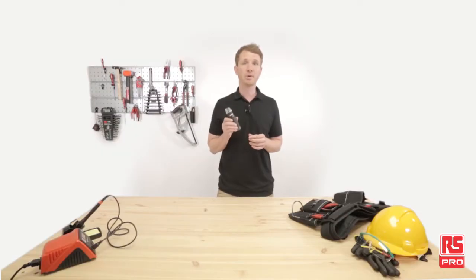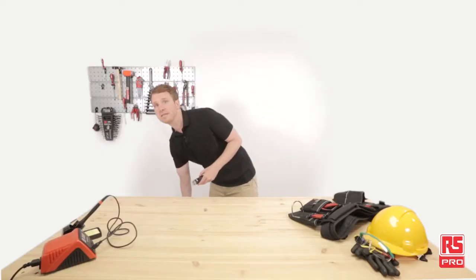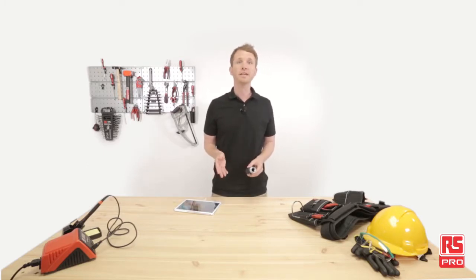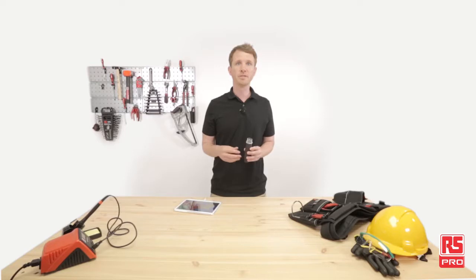The RS Pro MiFi is small, lightweight and really easy to operate. The built-in adjustable polarizer reduces glare and reflection on shiny objects. It has a focus range of 8 to 150 millimeters, 8 adjustable white LEDs and a powerful zoom of up to 200 times — you won't miss the smallest details. Built-in Wi-Fi transmission allows you to view the images on most popular smartphones, tablets and even on PC and Mac. The MiFi app offers additional functions such as measurement or copy and transfer of images and video.